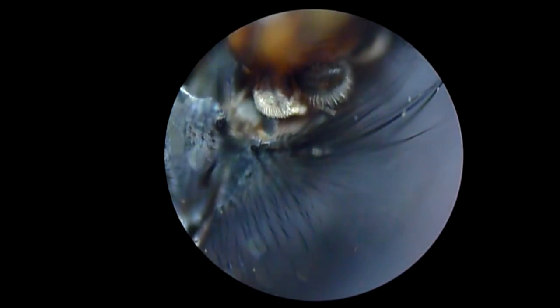Yeah, I think that's about it. There's enough stuffing around. So yeah, hope you've got an idea of what this Olympus microscope is all about. Fantastic. Thanks to Craig 2 for selling it.